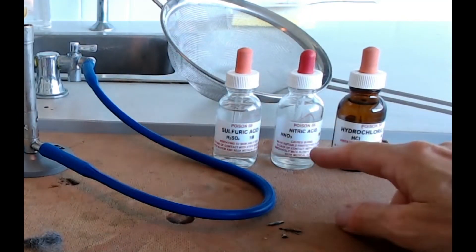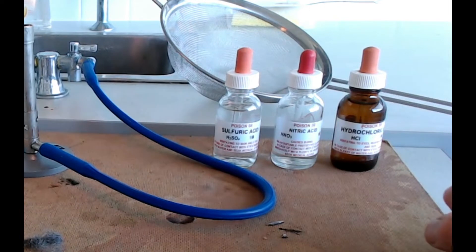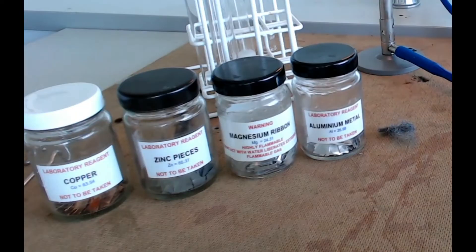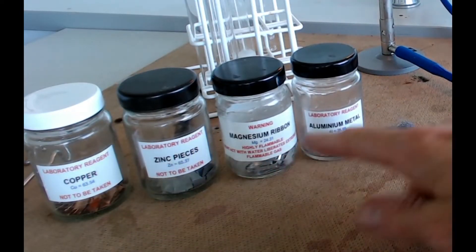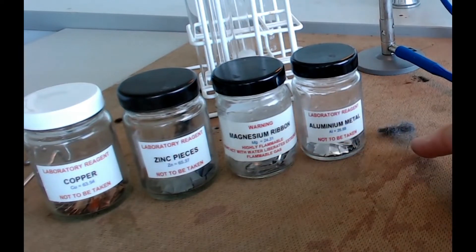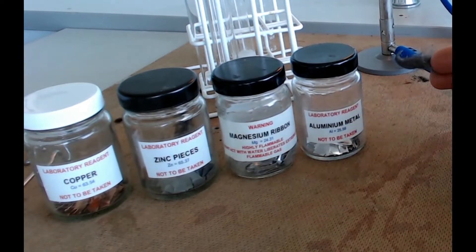So we've got sulphuric acid, nitric acid and hydrochloric acid. And you're going to need some metals which are copper, zinc, magnesium, aluminium and iron. And the iron is in the form of steel wool.